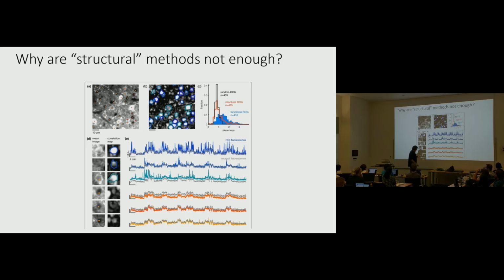This yellow one, maybe there's a yellow event that's actually coming from that cell. So maybe I guess there was something there, pretty dim, but there was a little bit of something on the activity map, the functional estimate. So yeah, still pretty dim. And so the danger is that if you're selecting your ROIs from one of these structural maps, you get a lot of things that just represent neuropil, and then you're just studying neuropil as the main component of your study, which is probably not what you want.